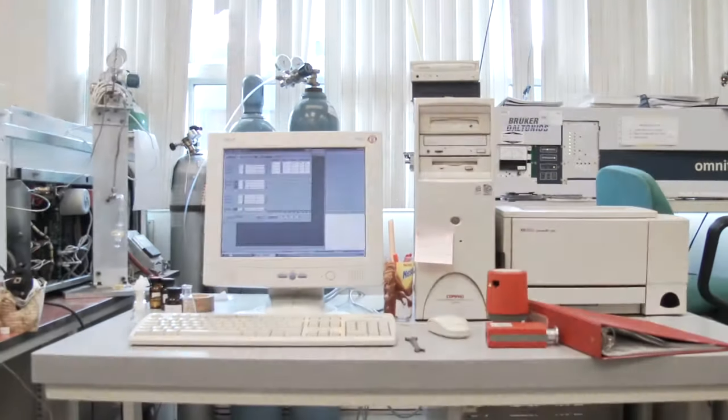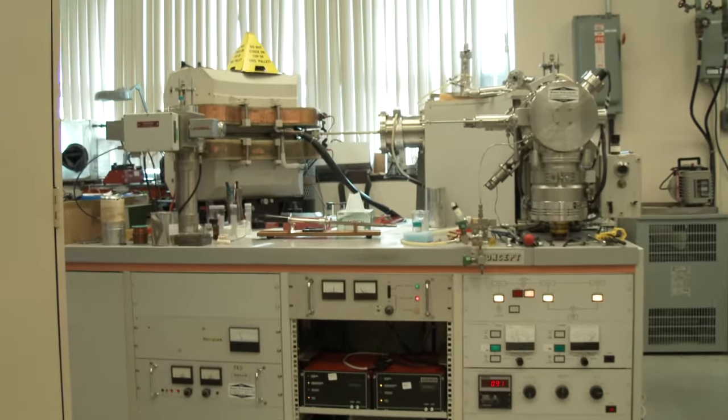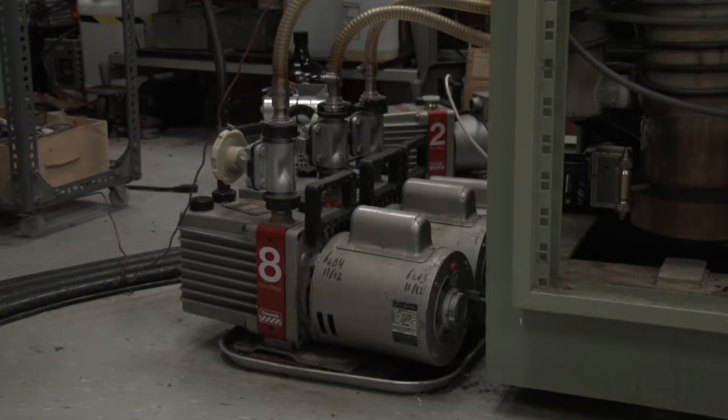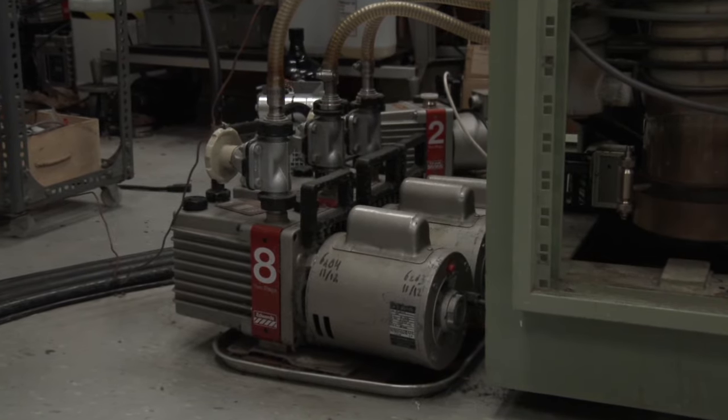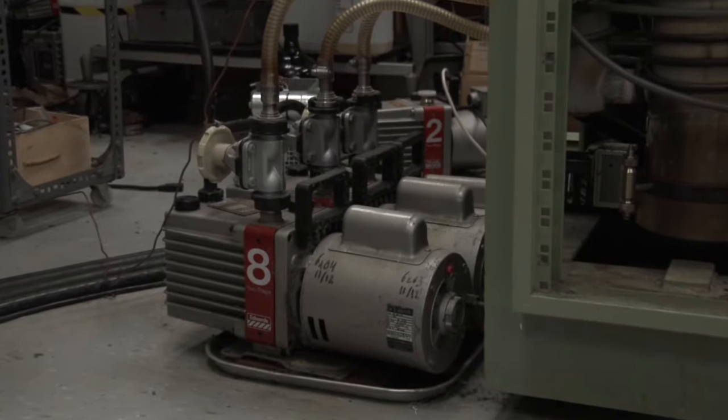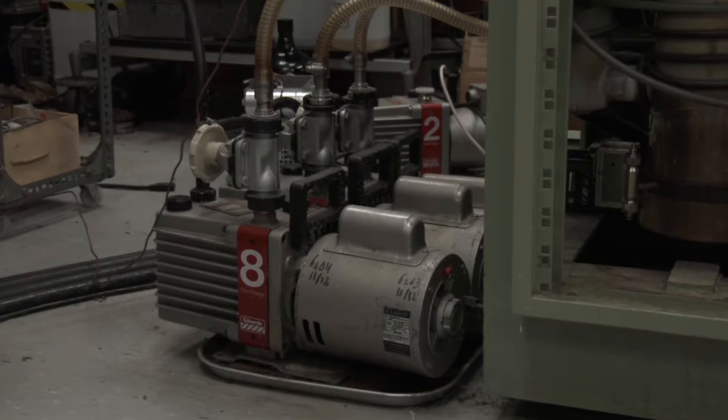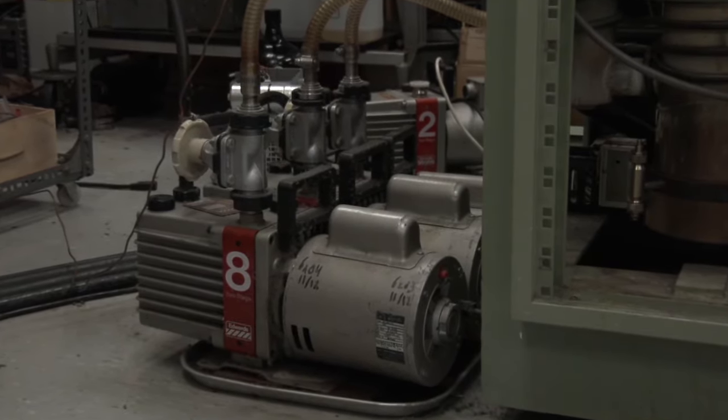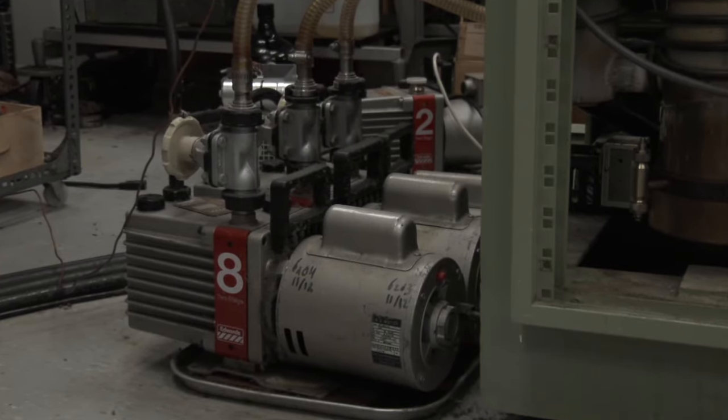Oxygen weighing 32 Dalton, nitrogen weighing 28 Dalton. To do this, we must employ vacuum pumps. The first pump used is the rotary pump, sometimes called the roughing pump because it gets us down to just the rough vacuum, or a backing pump because it backs up our better vacuum pumps. Here are three rotary pumps.